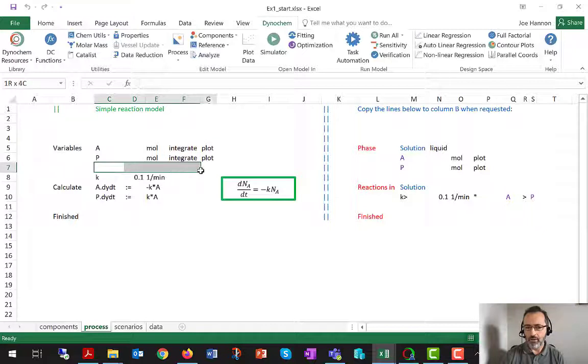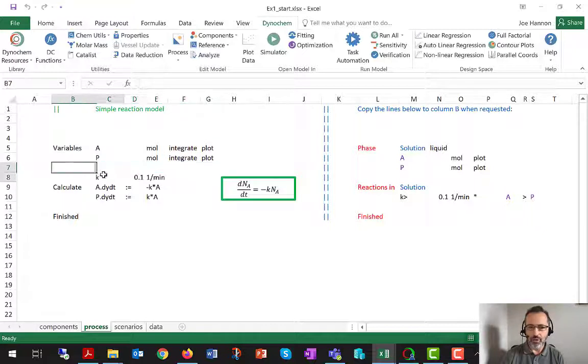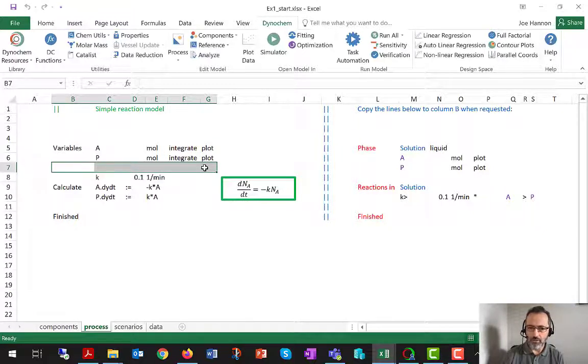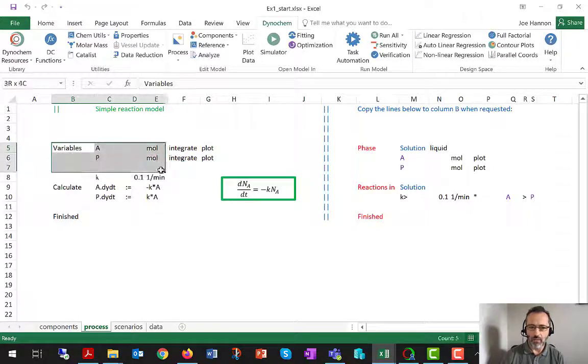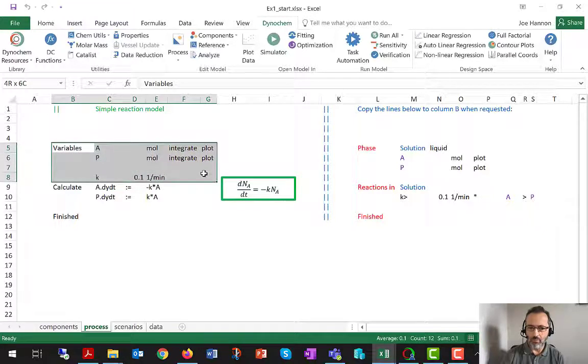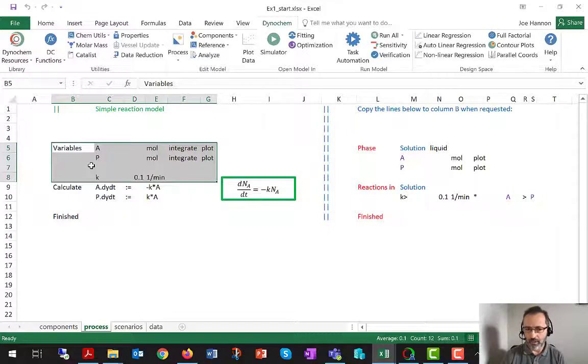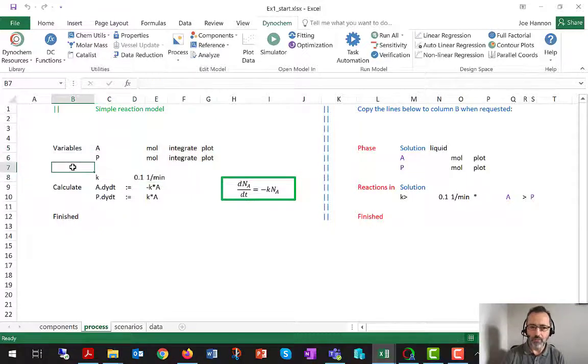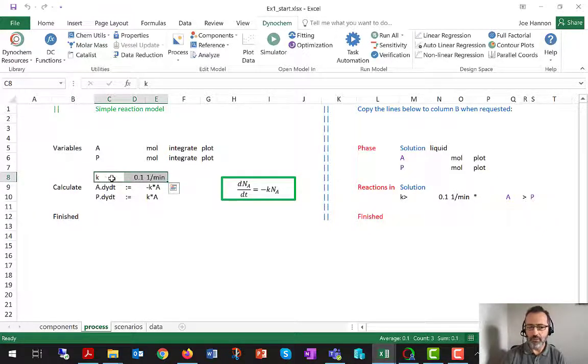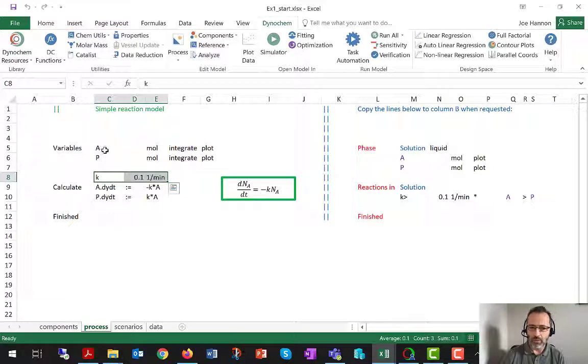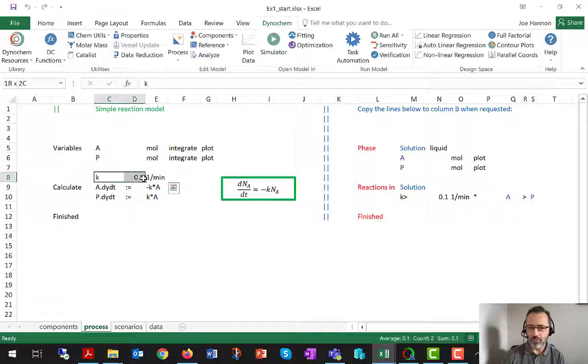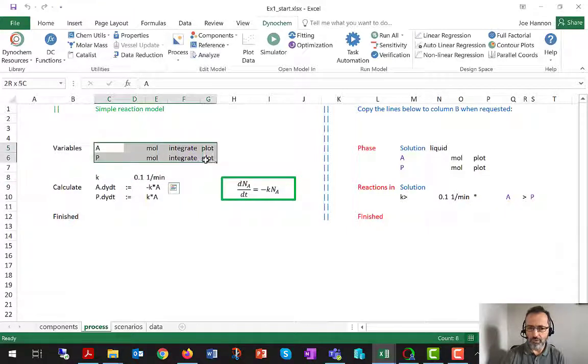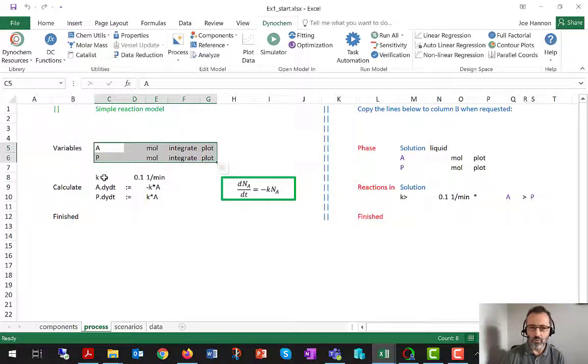There's a blank line here. Power users should know you can have blank lines even in the middle of a statement like we have here in the middle of a variables declaration. But I would say not too many blank lines, but you certainly can have them. And here we've just spaced things out a little bit so that the rate constant that's going to be used to calculate the first order reaction here is just a row below the declarations of the actual components we're going to track.